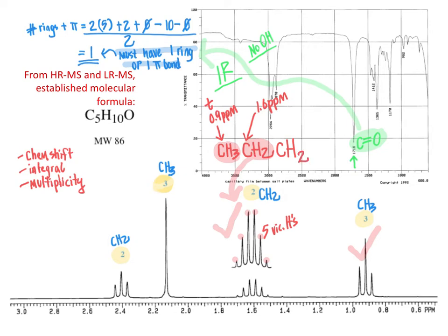So now, with it drawn out like so, this CH2 group has a total of 5 vicinal hydrogens. 3 over here, 2 over here, 3 plus 2 makes 5, which is our n number. n+1 makes 6, giving us the sextet that we see here, this complex multiplet of 6 subpeaks, which we have superimposed an enlarged version of just above the axis of our NMR spectrum just to make it easier to see. So be aware that this, what I'm highlighting with my laser pointer, corresponds to what you see below it. It's just an enlarged version so we can make out the multiplicity there.